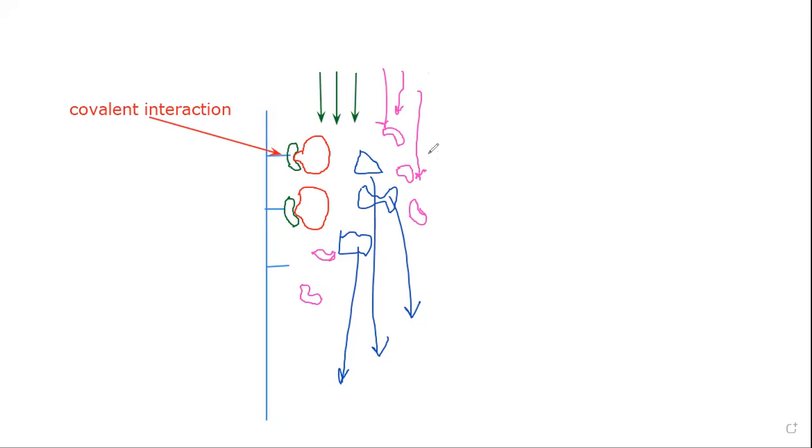So now can you imagine what will happen? This is going to interact with this component, which is sticking. Okay, the desired molecule, which is already binding to the column. The pink colored ligand, which is in the free state, will compete with this green colored ligand, which is bound to the column. So there is a competition now. And when I say competition, always remember that these molecules, the pink colored molecules, are in excess. I'm adding that in excess.